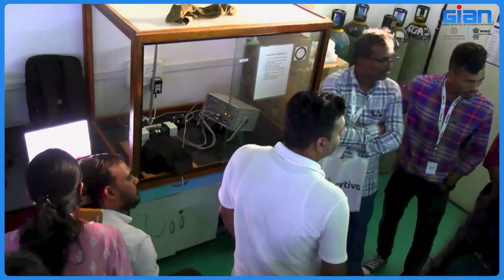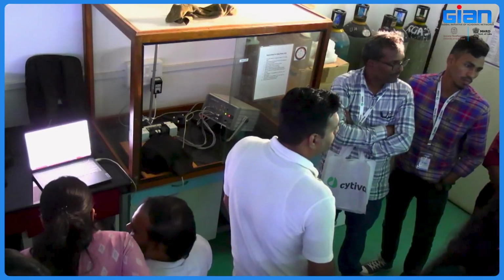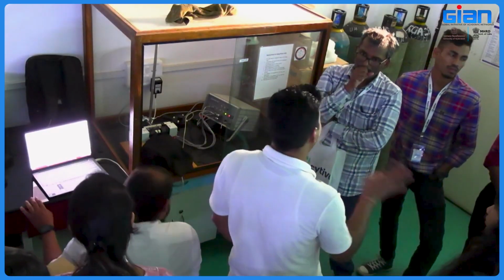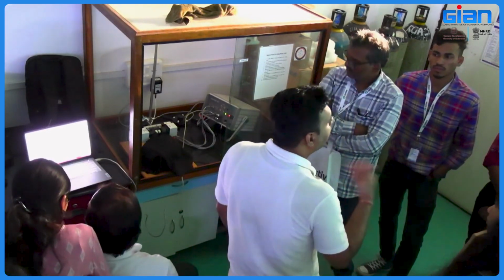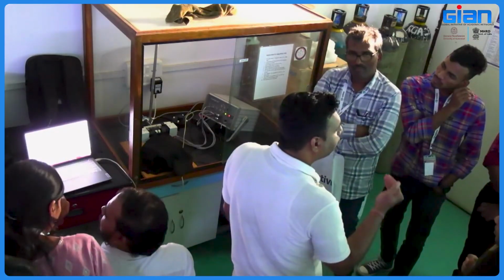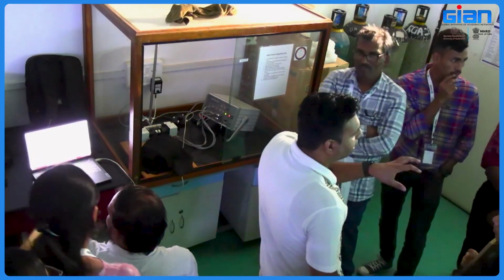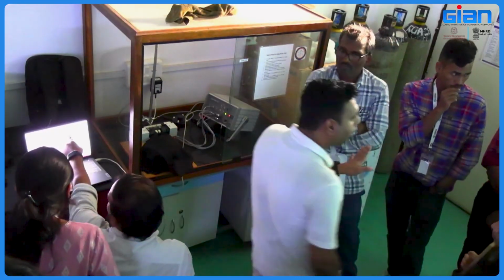We take from the dark, and many plants are there. So can we take them after one plant? Yes, you can take. I told you the minimum time of dark adaptation is 25 minutes. If you extend it to 1 hour, it's fine, at least for plants. You can extend to 2 hours also. For slow kinetics, we dark incubate for 3 hours. But the minimum amount has to be met. A 5 to 10 minute, 20 minute, 30 minute or 1 hour gap is also fine. We are just making sure that the PS2 reaction centers are completely open. After 20 minutes, the reaction centers are all in the oxidized state.